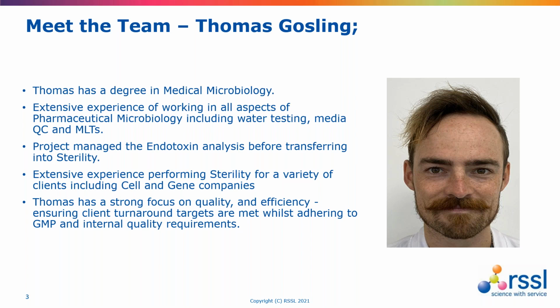So you mentioned that you are involved in running and writing the sterility validation for our clients, and this has included some of our cell and gene therapy clients. Can you tell me what the main challenges you've come across with this particular type of work?